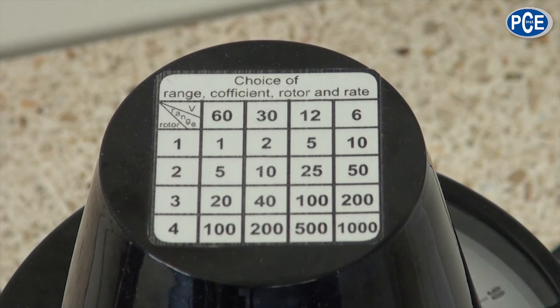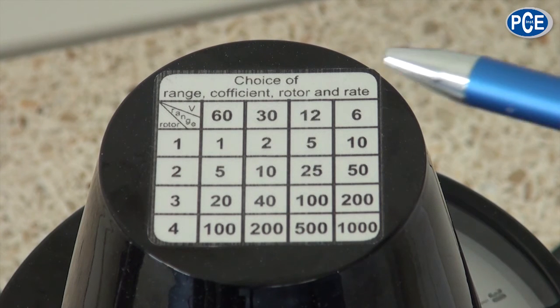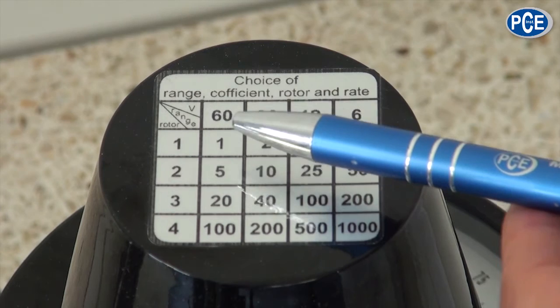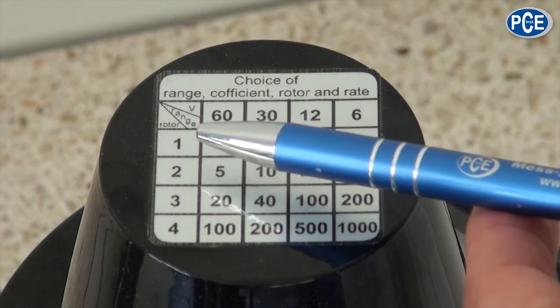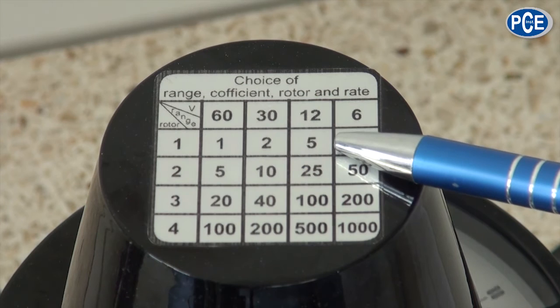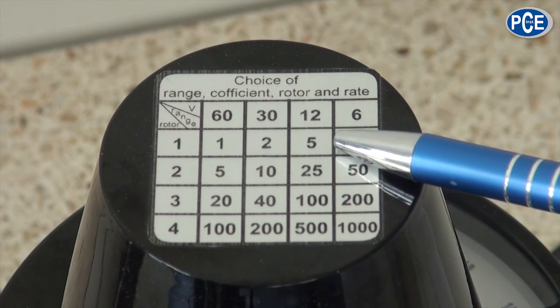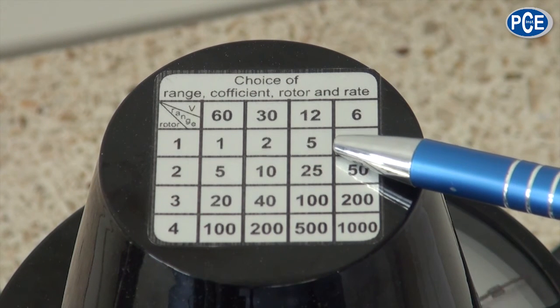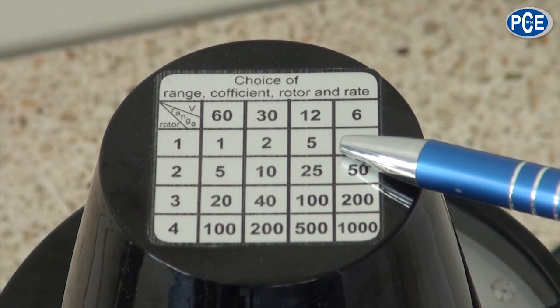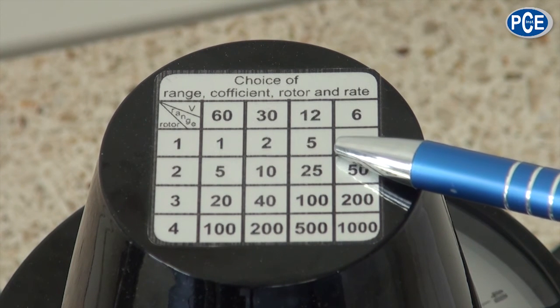To get out of the measured results the absolute measuring result, I need a constant. And with the help of the table I can find out the constant. We have here on the left 4 numbers, that are the numbers of the rotation bodies. Here we have the rotation size. One that is the biggest with a rotation speed of 12, that gives a conversion factor of 5. I have to multiply the measured result with 5 to find the absolute viscosity.